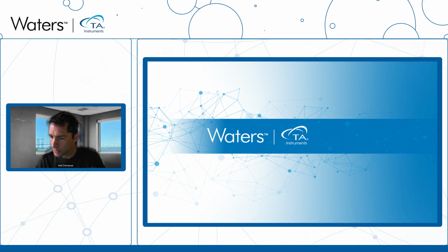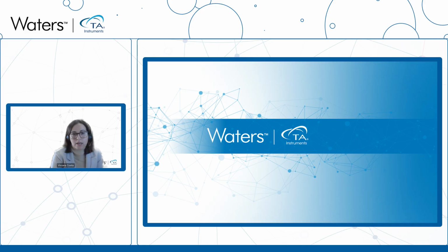Looks like we might have a previous DSC user here. Do you need to degas samples? Typically, it's best practice to degas samples for DSC analysis in general. This is because as the solution is heated, any gas bubbles that might form during the scan can cause random thermal events in the baseline. In the RS-DSC, since the volume is much smaller, you might not find the need to degas, but we still recommend it as a best practice.